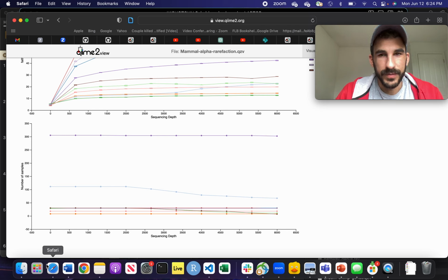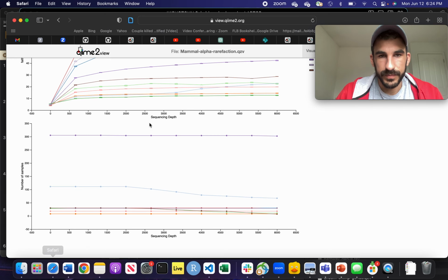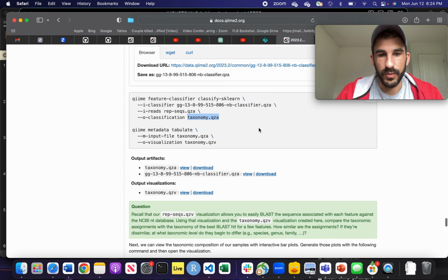If you've stayed this far in the video, then a little tip would be to run the alpha-rarefaction step before you run the core metrics. Or if you had already been following along, then just rerun it if you feel like you need to. So cool, we're done with that step. Now go back to the tutorial.